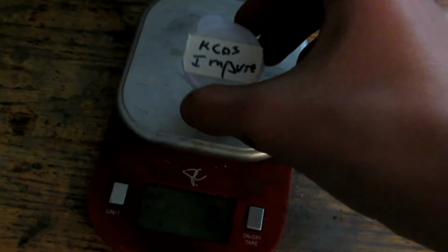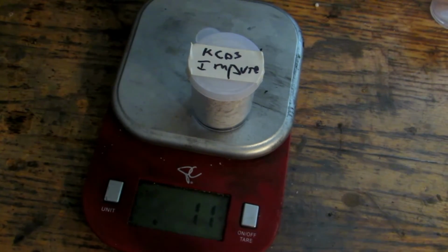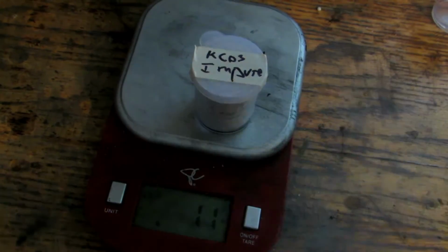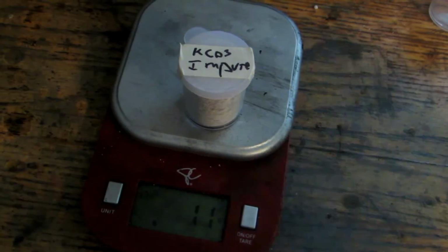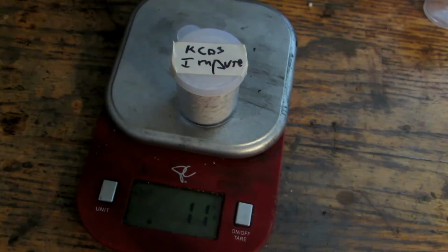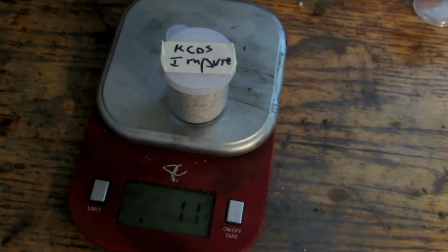Upon decomposition of our potassium carbonate, potassium oxide can be reacted with water, and this will then go ahead and form potassium hydroxide. The hydroxide is what we're going to be using. And this potassium carbonate was originally made from cream of tartar, which is potassium bitartrate. So this is making potassium hydroxide from household materials that you can easily obtain. And potassium hydroxide is honestly not the easiest thing to get, but it's very useful for neutralizing acids and forming potassium salts, and it has a variety of other uses.